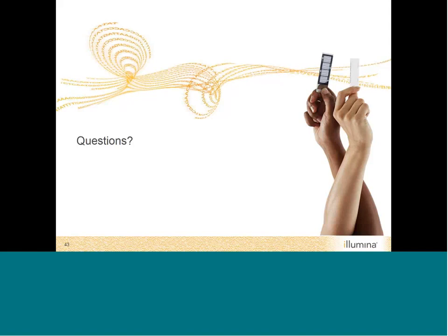But sometimes, if something went wrong, if for any reason reads cannot be identified and demultiplexed with the index read, they would go into the undetermined. So if you feel like you have an unusually high value, something that is a lot higher than the PhiX that you added, then maybe you want to give us a call. We can take a look to see what happened. Maybe the reads were just thrown in there because for some reason they couldn't be associated with the index that we entered, and that can have a variety of different reasons. Sometimes we can fix that. So give us a call.